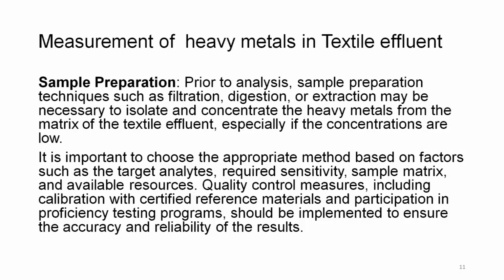It is important to choose the appropriate method based on factors such as the target analyte, required sensitivity, sample matrix and available resource. Quality control measures including calibration with certified reference material and participation in proficiency testing programs should be implemented to ensure the accuracy and reliability of results.